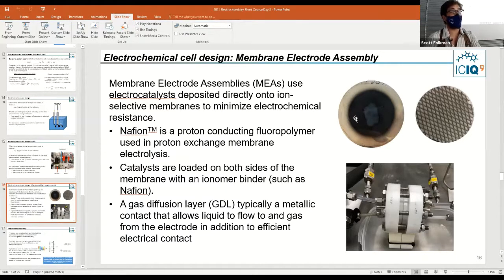Yes, so an audience member asked, let's say your Faradaic efficiency is really low and you're trying to account for all of the products, basically, right? You're sure that it's low, but something else is happening, that you are not reducing or oxidizing any products, but something is happening with your catalyst. Okay, so that's a tricky question, and that's kind of a philosophical question as well.